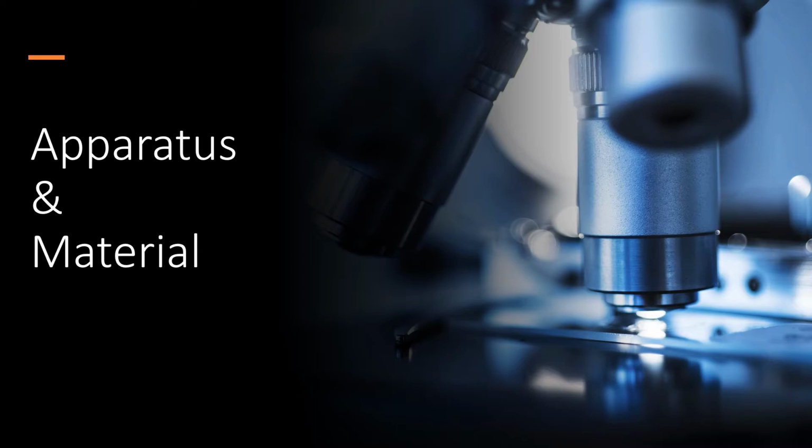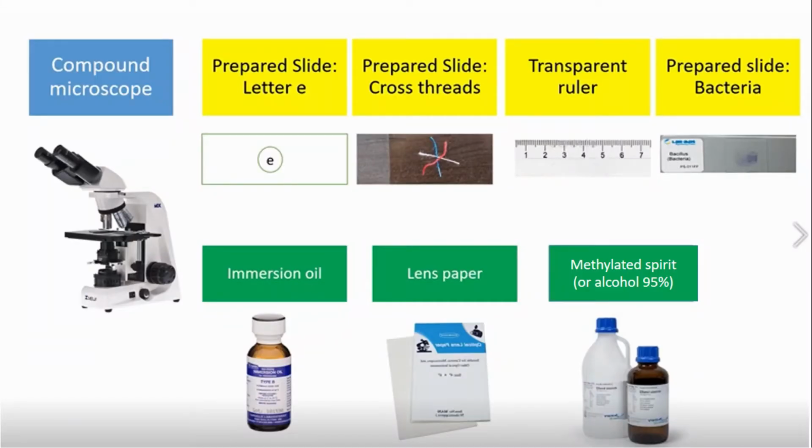For the apparatus and the material that we need to use in Experiment 1 include 1 compound microscope, 4 different sets of prepared slides, which is the letter E prepared slide, cross-thread prepared slide, the transparent ruler, and the bacterial prepared slide. Another 3 materials required for this experiment are the immersion oil, lens paper, and alcohol. These 3 materials are required for the oil immersion technique.